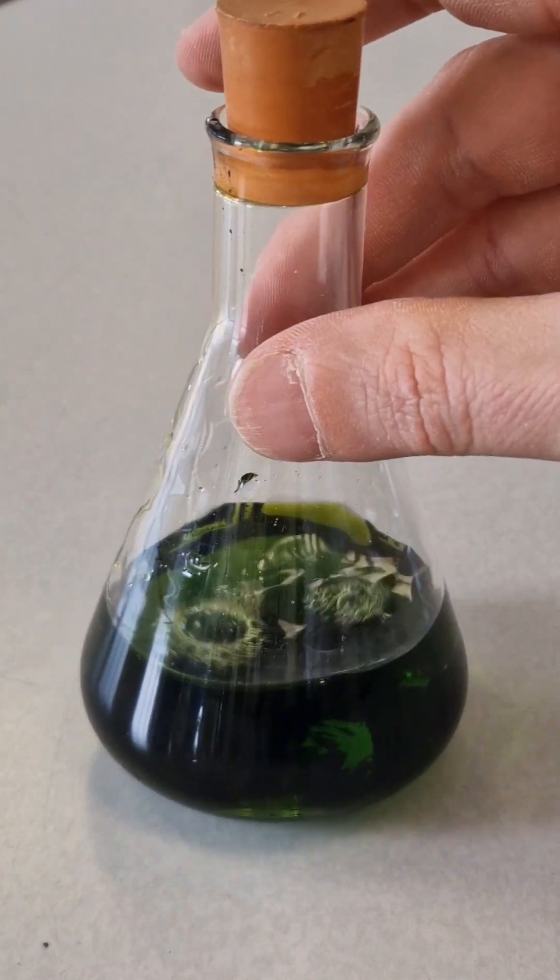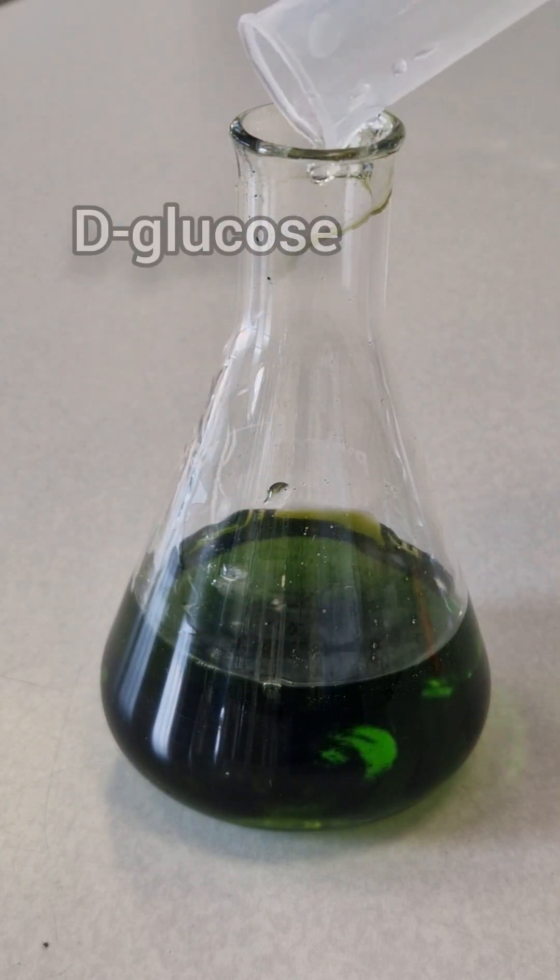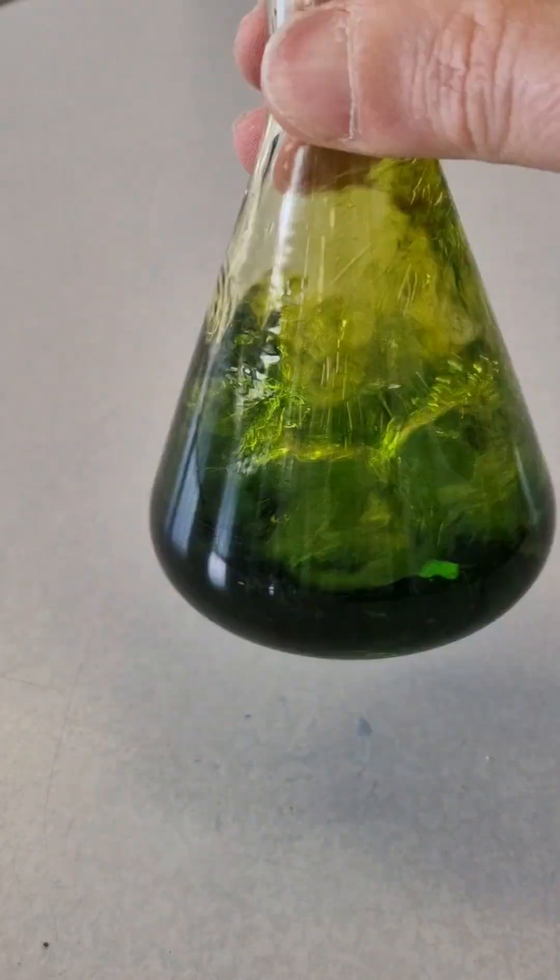Next we're going to add some D-glucose. Now glucose is a reducing sugar. Keep that in mind for what's going on later on in the experiment. Shaking again, you'll see the colour of green now lightens slightly. And now we're good to go.